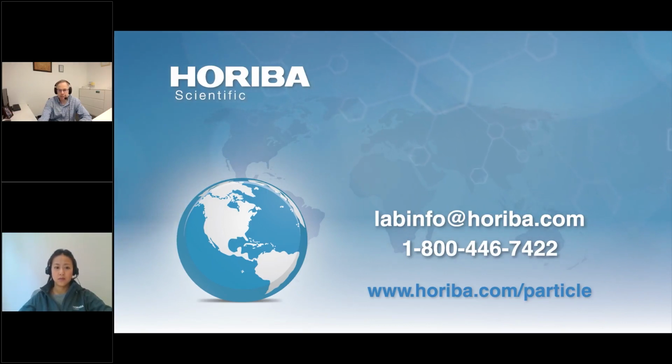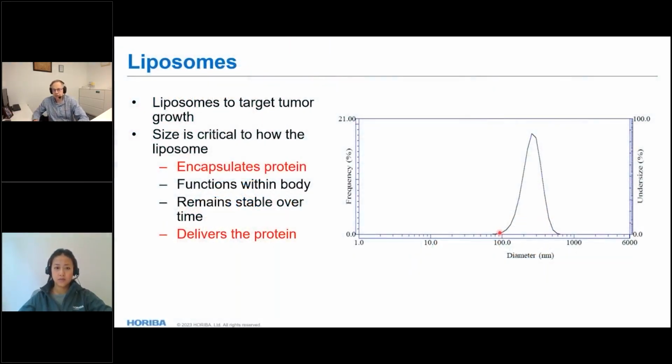Okay, here's a distribution. You want to talk about D10, D90, D97. Dynamic light scattering is not really a great way to get at those numbers. In fact, it's not very impressive at all.